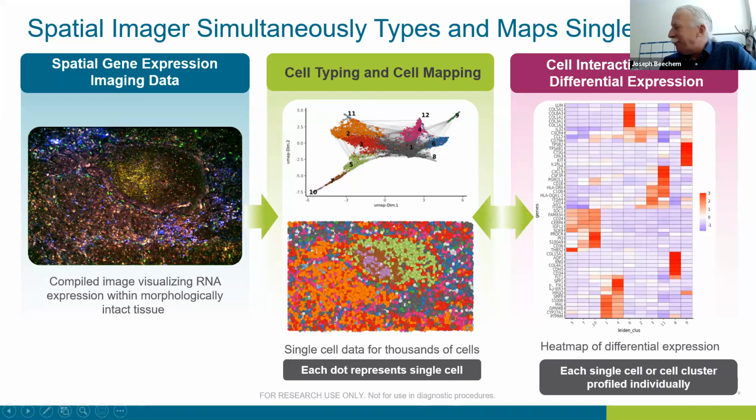Let me find one that I can read with my glasses here. Hey, let's take a look at a cluster. I don't know. Yeah, cluster 5 is the first one in here. Oh, okay, cluster 5 right over there. This little green cluster of cells has a whole bunch of markers that are hot in that particular cell cluster, a UMAP cluster, if you will. And then you can just walk your way through the clusters, reading off the genes specific to those particular clusters.